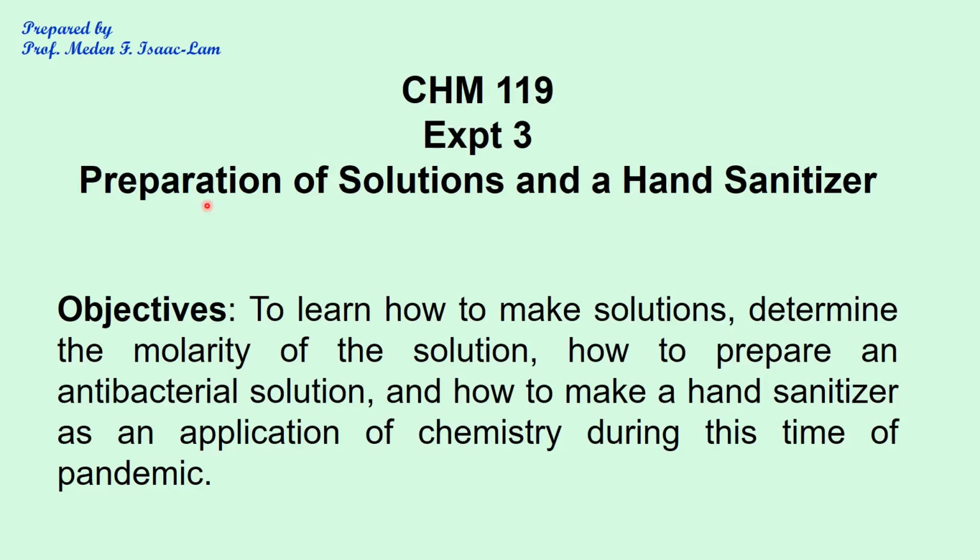Experiment 3 is about preparation of solutions and a hand sanitizer. Objectives of the experiment are to learn how to make solutions, determine the molarity of the solution, how to prepare an antibacterial solution, and how to make a hand sanitizer as an application of chemistry during this time of pandemic.